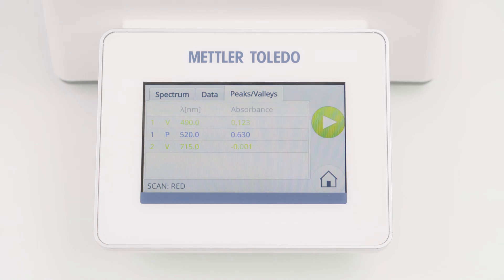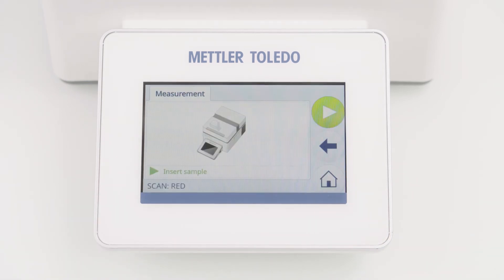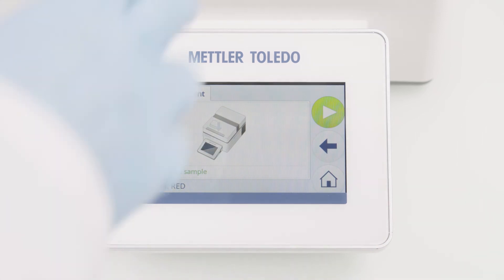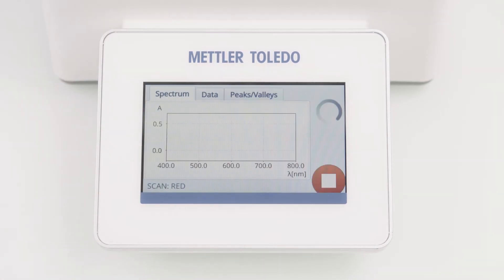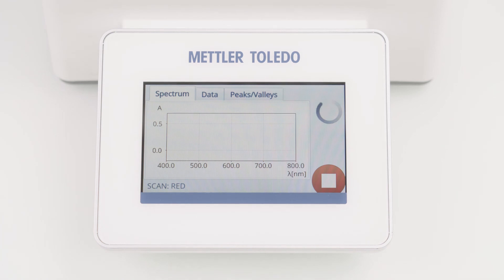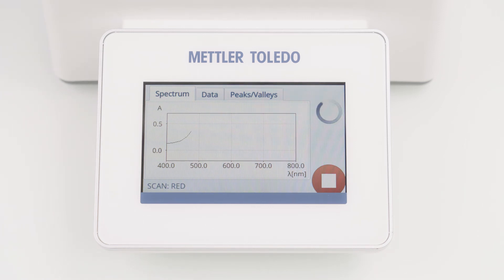To measure additional samples with the same settings, simply click on the Start button again. I am now directly asked to insert the sample. That's because the blank measurement is stored for 7 days and no new blank determination is necessary, even if I am leaving the method. Simply follow the instructions to continue with further measurements.